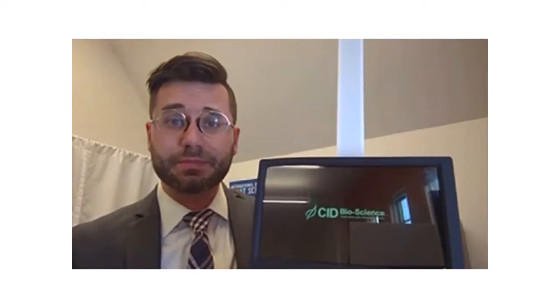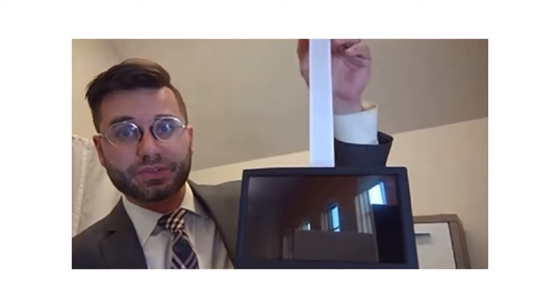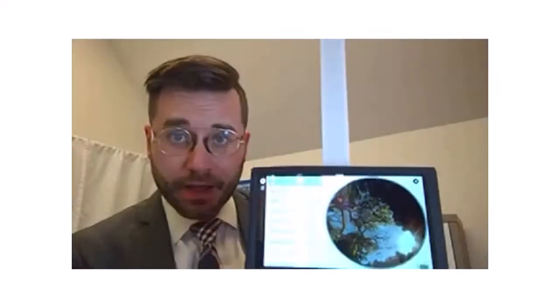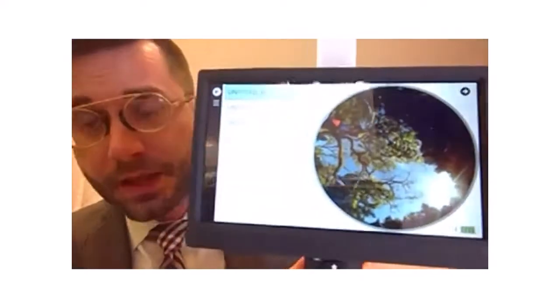Once the instrument starts up, which can take a second every now and then, what it's doing as it starts up is getting the environmental readings from the PAR sensors, as well as from the camera. And it starts automatically into the last images that you took. Now let's make sure you can see this. As you can see, it's taken some canopy images previously.